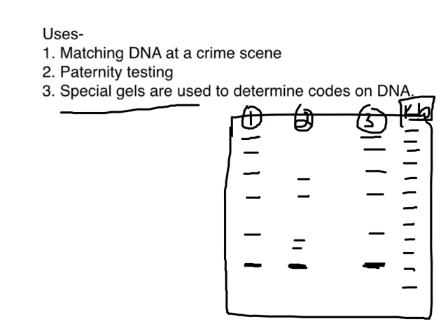The other place where you would use this is paternity testing. Paternity testing is the baby daddy testing. That's where you're trying to see who the potential father is of the baby, which one is actually the baby's father. And you're going to do one of these for practice.